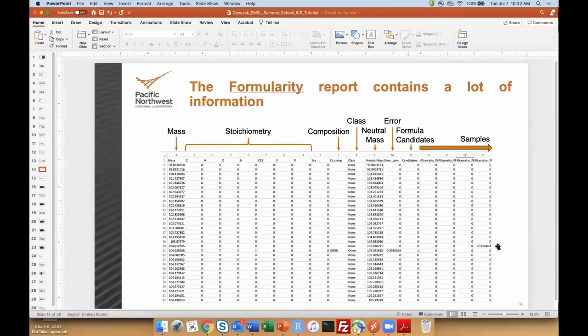And then after that last column, we have a whole bunch of samples that contain information about intensities, and that's, again, my stress. Even though it might be tempting to use those intensities, I highly recommend always changing them to presence absence for our purposes. There are certainly experimental reasons where you might want to use those intensities, but this is not one of them.